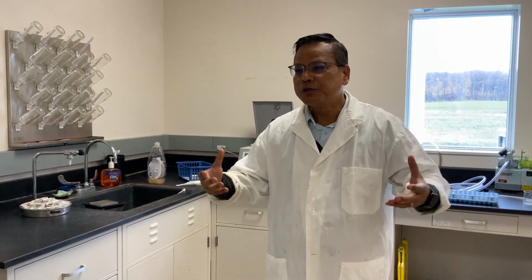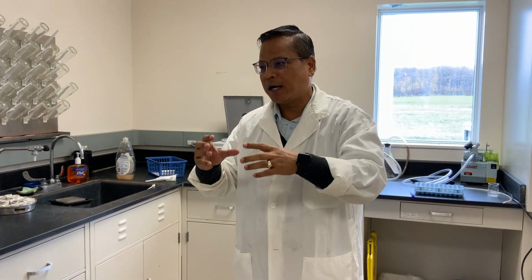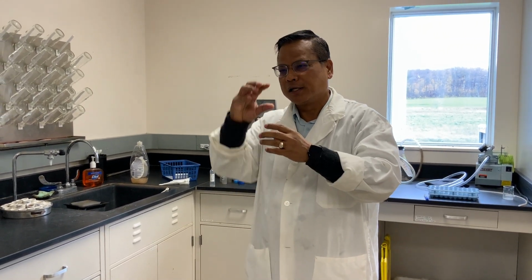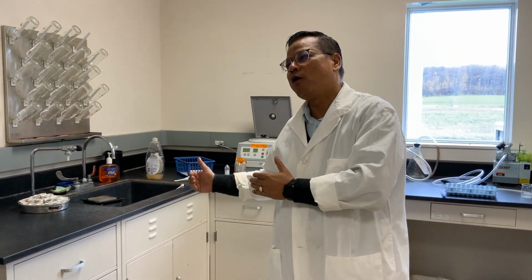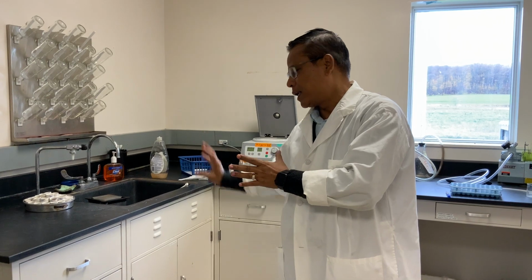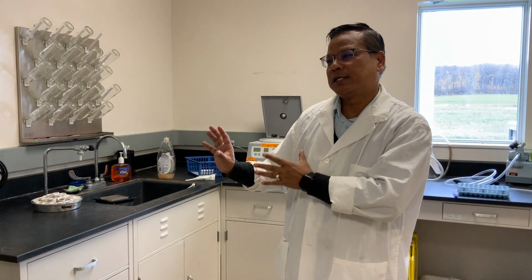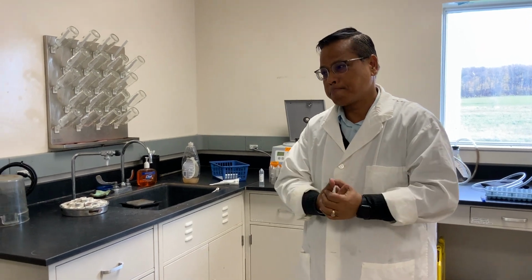So what we'll try to do is automate the system a little bit by introducing these NIR sensors, where we try to get the NIR spectral data to correlate with your gravimetric analysis, and we make those a teacher signal, the signals that are non-parameters. We do that one, and later on, with this established spectral signature, we try to analyze, once the treated water is coming out, how much TS and TSS is contained there by analyzing their spectral characters. This is a part that we are trying to work on, establishing the correlation.